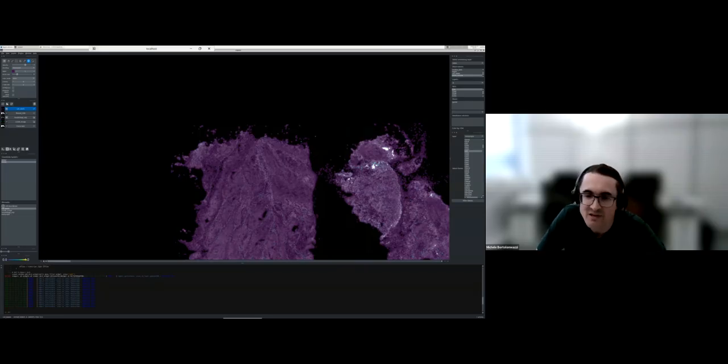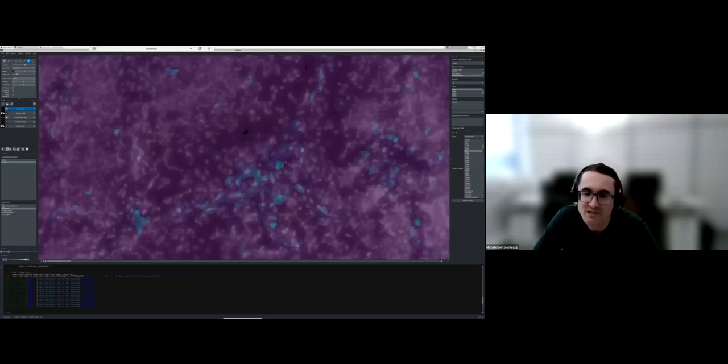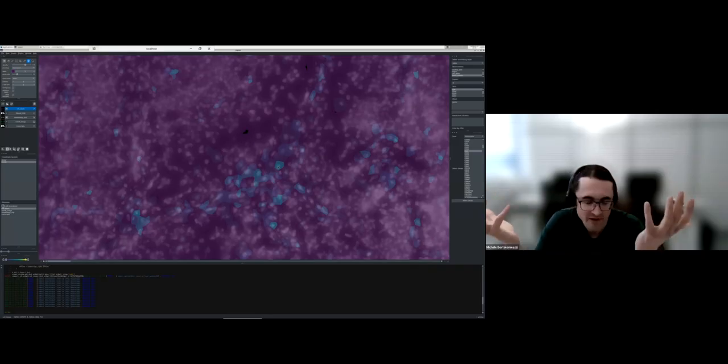Here we can already see that most of the tissue is on the purple-violet side, so not expressing, but when we zoom in to the stroma, we can see this is actually our CD4 positive cell.